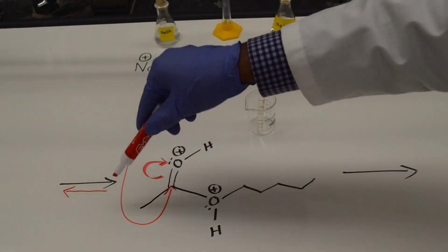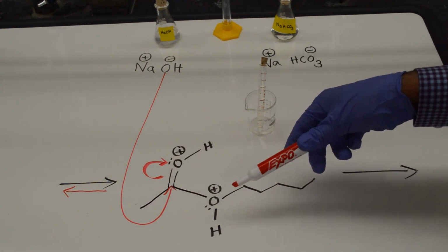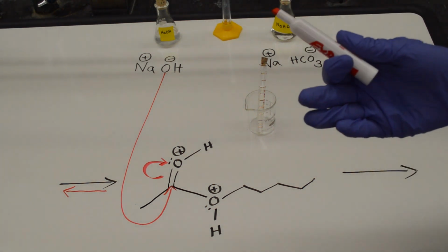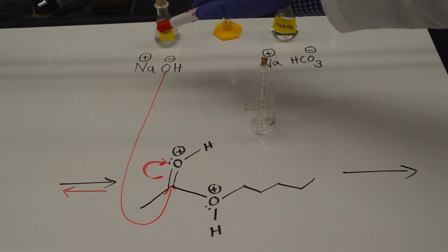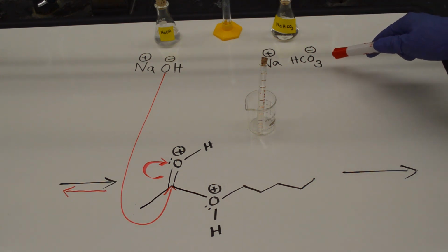Right. When you put the hydroxide on this acyl carbon, the alcohol will be gone, and what you get is an acetic acid, which is our reactant. So we don't want to use the strong base as well as nucleophile sodium hydroxide, we would use sodium bicarbonate.